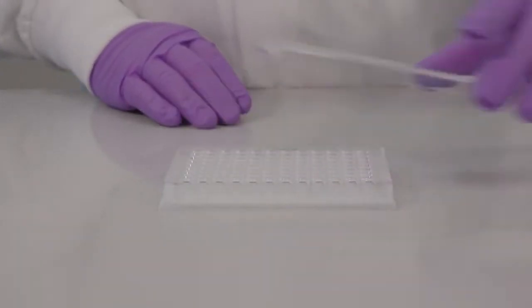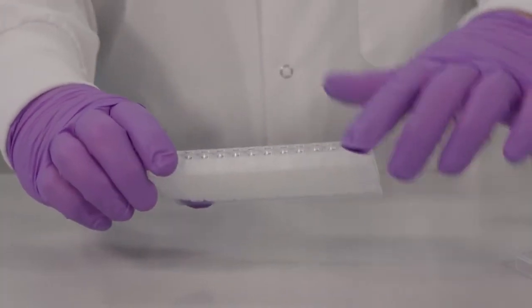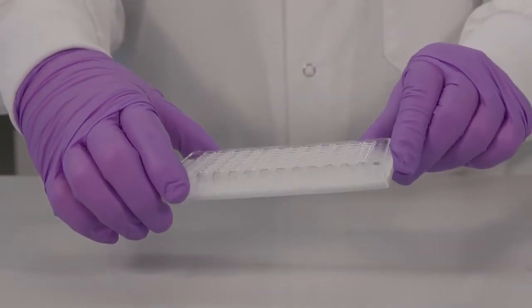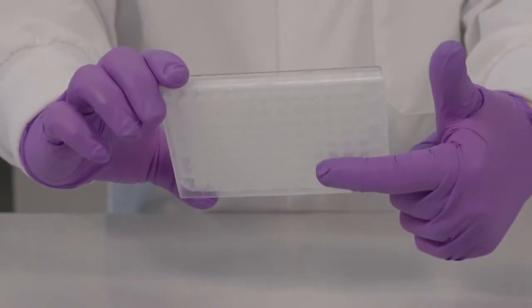For some assays, such as radio immunoassays, the under drain of the multi-well filter plate can be separated from the housing containing the filter in case separate analysis is needed. This also allows removal of the unwanted hold-up volume under the membrane in the under drain chamber.